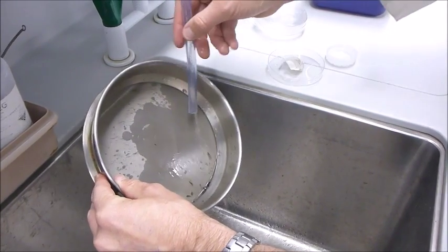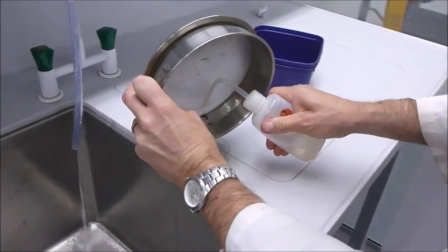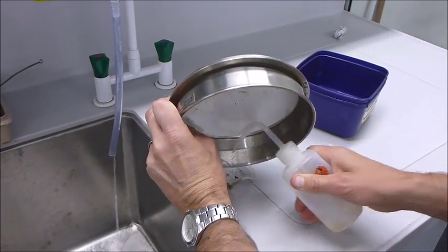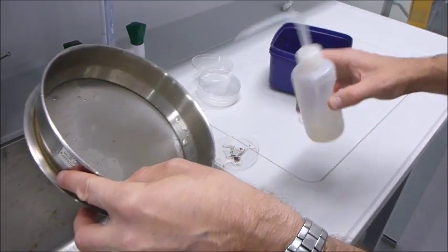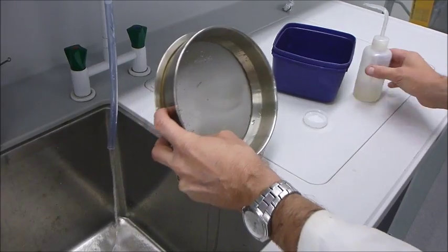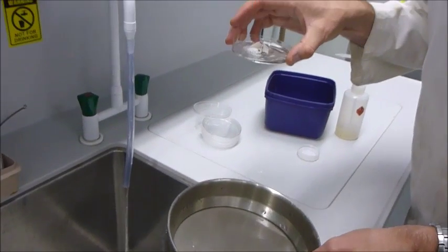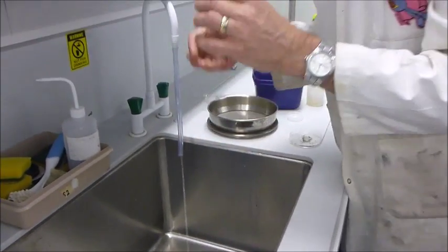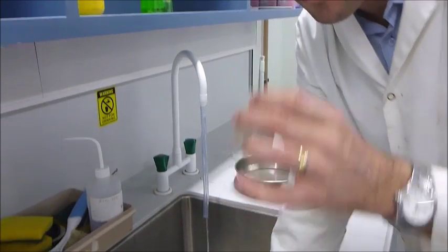And then I'm going to transfer this into a petri dish with the assistance of the squirty bottle to make sure I get all those bugs into the petri dish. So I need to check the sieve that there's nothing left behind. And now I'm ready to go and look at that under the microscope. But before I do, I'm going to take my empty jar and pour my ethanol back in there, because I'm going to use that again in a minute.